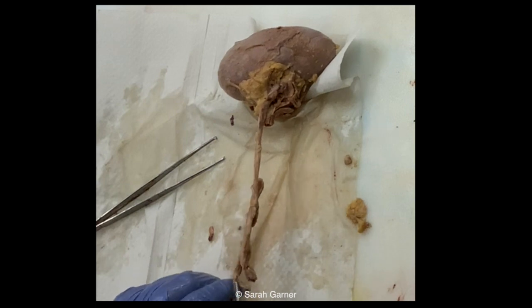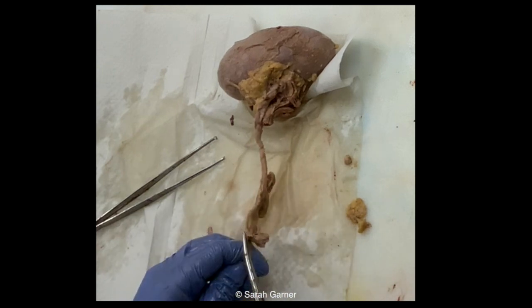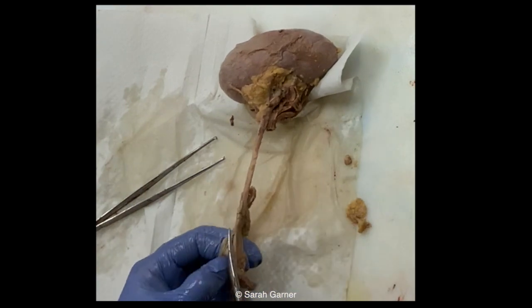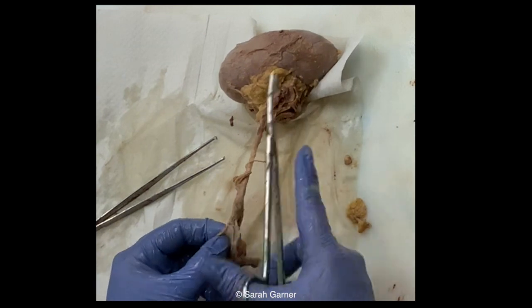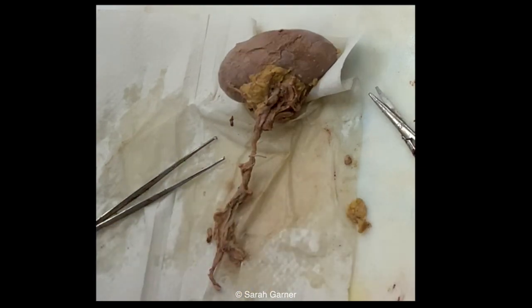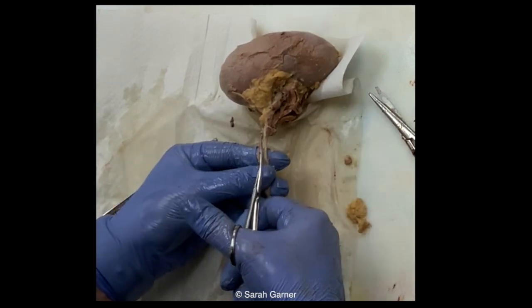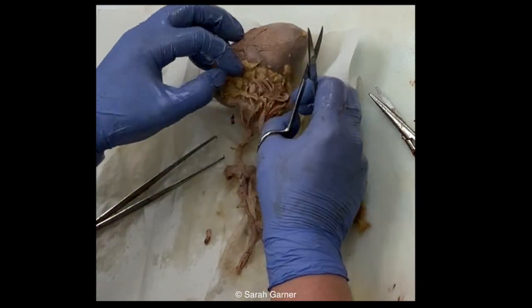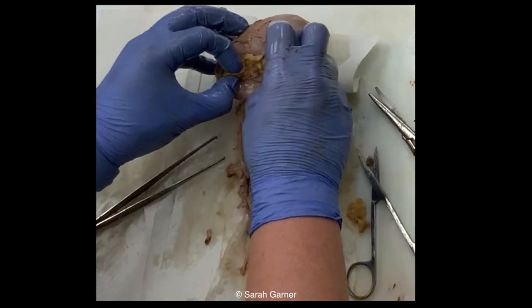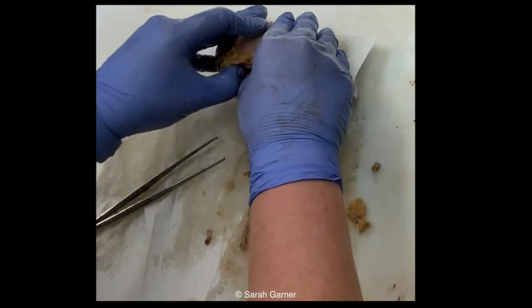Okay, so we're getting there. There we go. These are a little bit too big for this, but you can do it. So we're opening up the ureter, examining the inner lining of it. It should be pretty smooth. Okay, so we're examining our lumen and we get it all the way up to the renal pelvis. See how much wider it is up here? You want to open it all the way up to the level of the hilum, and then that way you'll get a nice cut when you bivalve it.